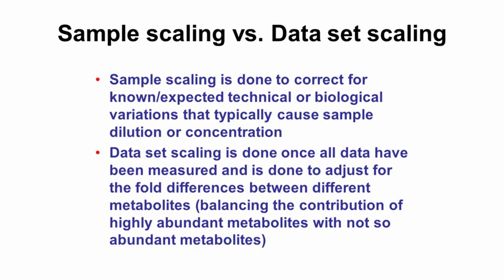So these can cause or lead to an inadvertent dilution or an inadvertent concentration. So we're just trying to make sure that everything is roughly comparable, and that a weighing mistake or a processing mistake or a sample that's been processed differently or handled differently doesn't throw things off.